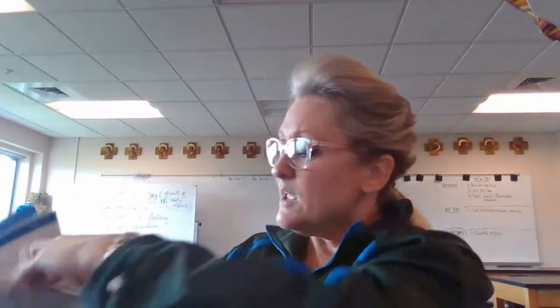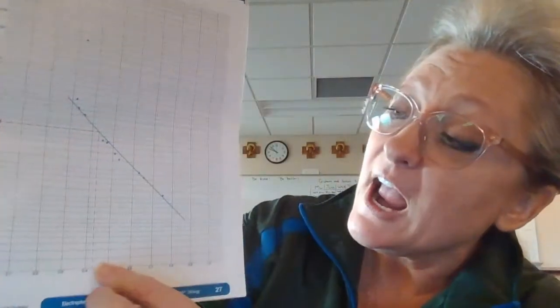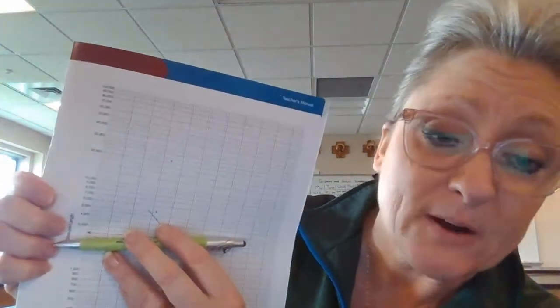So I would go over to here. My RF for this first band is 0.43. I calculated that out and got an RF of 0.43. Then I come over to here and see at the bottom, I go to 0.43. I take my ruler and go straight up to where it hits the best fit line. At the point where it hits the best fit line, I turn my ruler the other way and go straight over to my base pair lengths, and I see that it comes out between 2,000 and 3,000. So I'm going to say that's about 2,500 base pair lengths, maybe a little bit more, like 2,600.